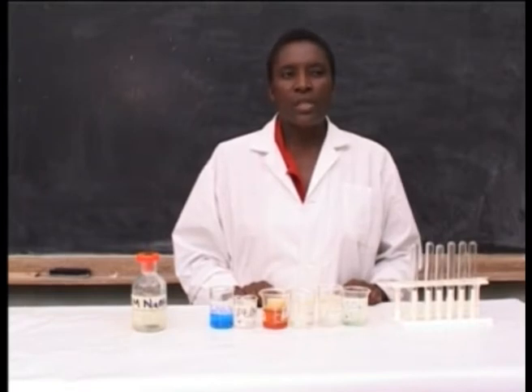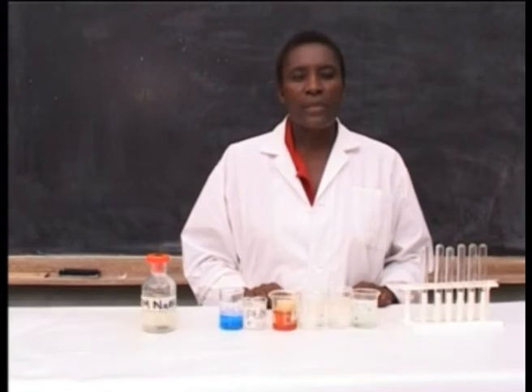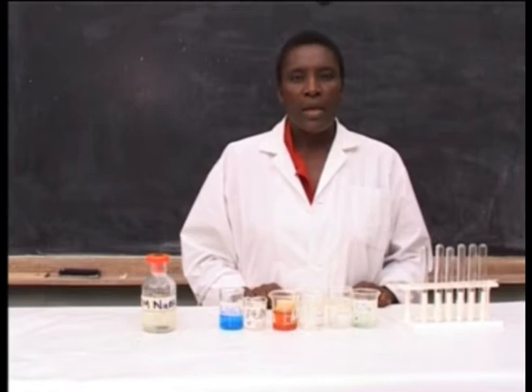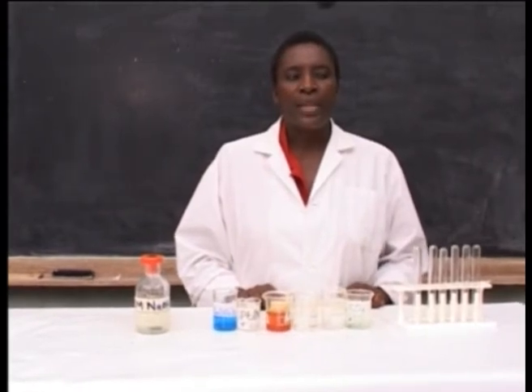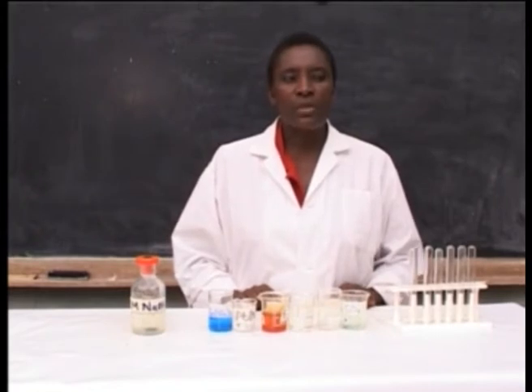Salt solutions react directly with sodium hydroxide solution. There are salts which form an insoluble precipitate in excess of sodium hydroxide solution and those which dissolve in excess of sodium hydroxide solution. Aim: to examine the products of reaction between salt solutions and sodium hydroxide solution.